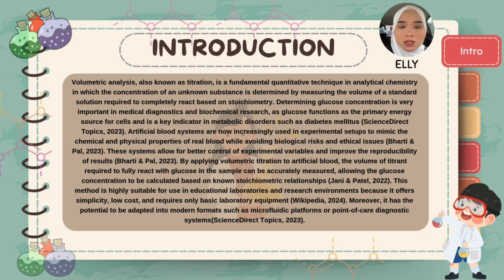Determining glucose concentration is very important in medical diagnostics and biochemical research, as glucose functions as the primary energy source for cells and is a key indicator in metabolic disorders such as diabetes mellitus.